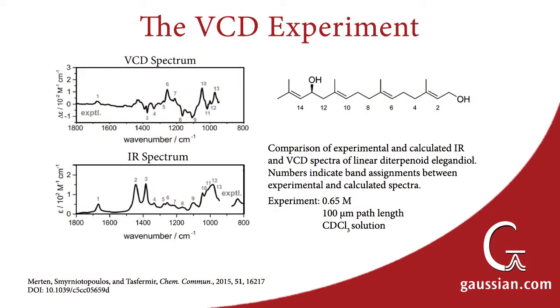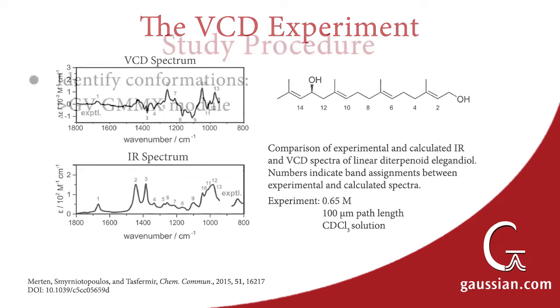We want to predict the VCD spectrum for elegondiol. Here are the IR and VCD spectra for this molecule from the original study, along with the experimental details. The VCD spectrum is on top. These researchers found excellent agreement between calculation and experiment.